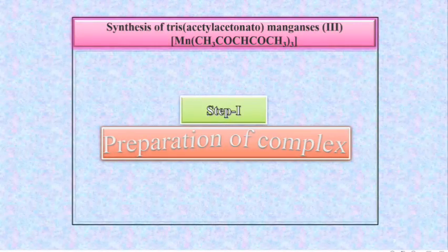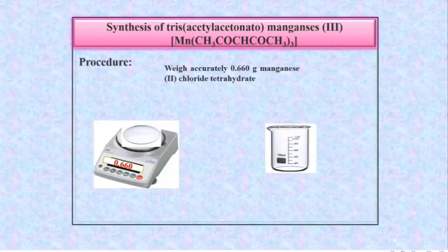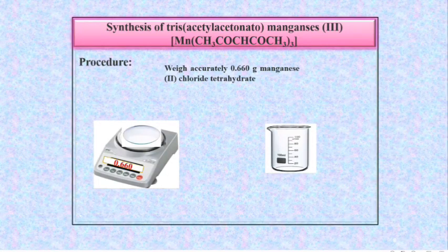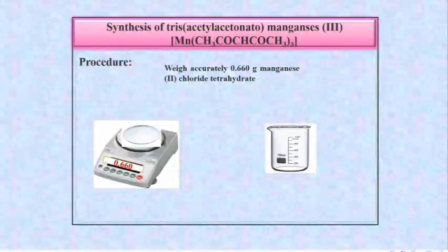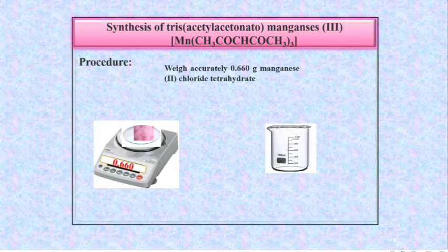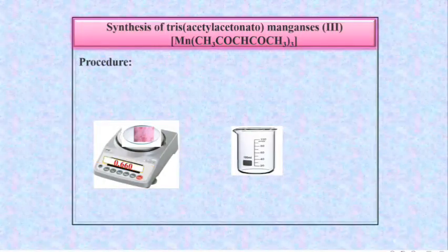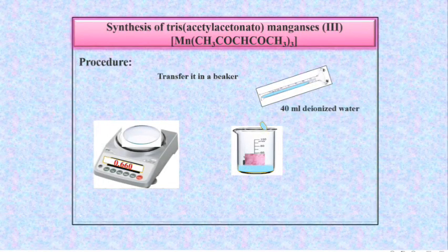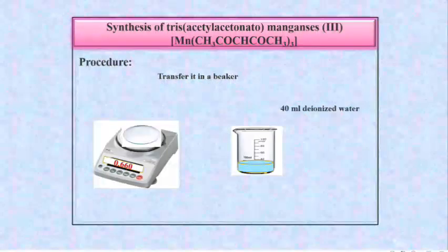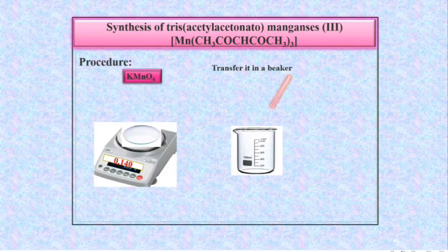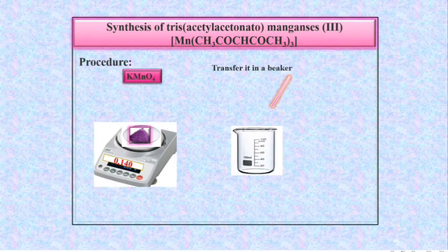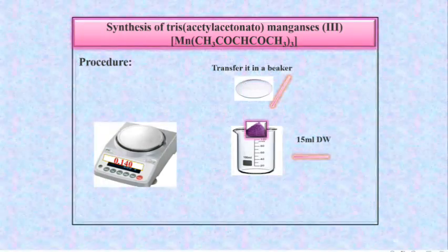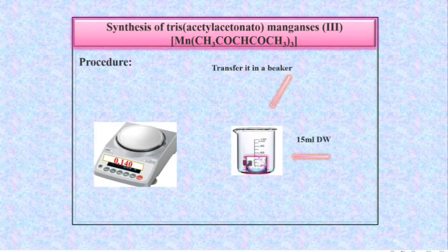Step 1 is the preparation of the complex. Weigh accurately 0.660 g of Manganese Chloride Tetrahydrate. Then transfer it to a beaker and dissolve it in about 40 ml of deionized water. After this, weigh 0.140 g of KMnO4 on a watch glass, then transfer it to a beaker and dissolve it in 15 ml of distilled water.